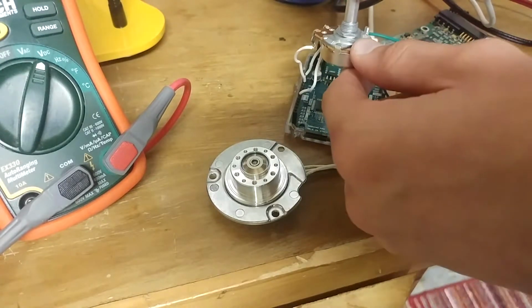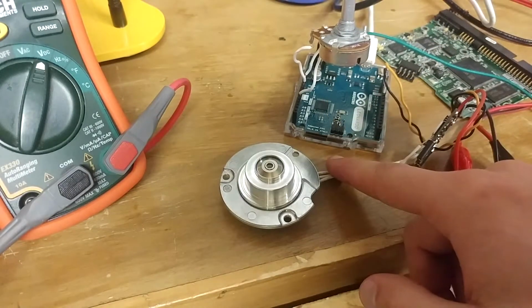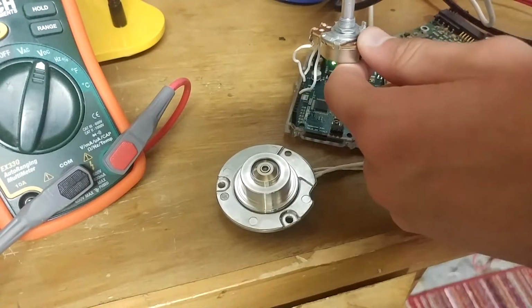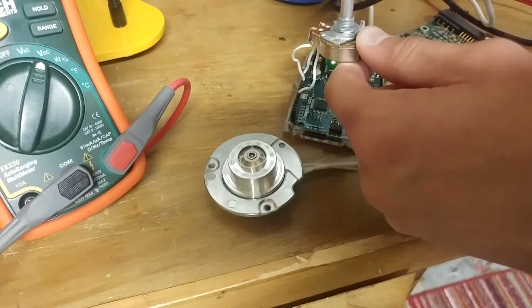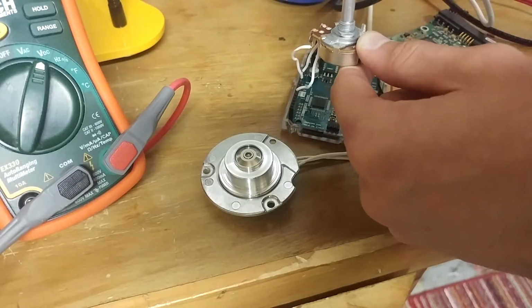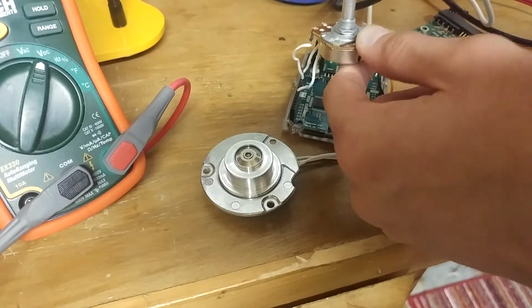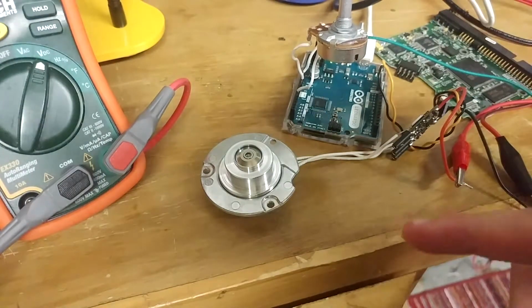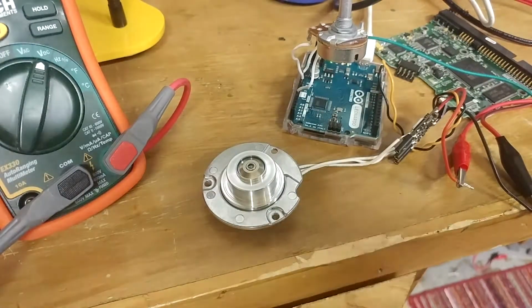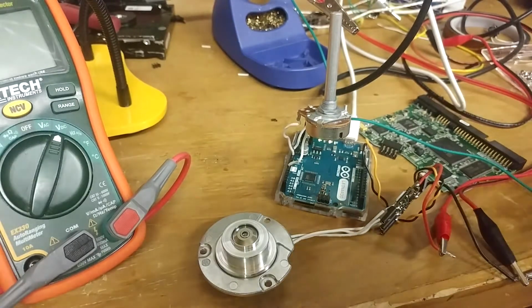Now it's stopped, but if I speed it up just a little bit, it does this weird twitchy stuff, where it doesn't actually spin up properly and just kind of twitches around, and you have to get it up to a threshold until it'll start to spin smoothly. And then beyond that, you can lower it back down a little bit past the point where you had to bring it up to, and it will spin smoothly, but you just kind of have to get it started in a way.